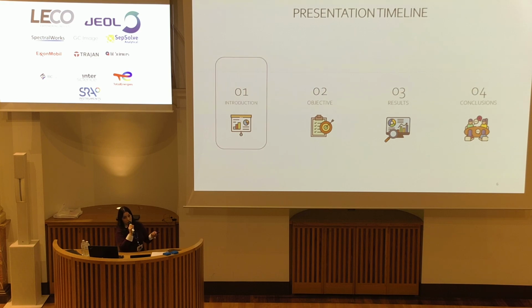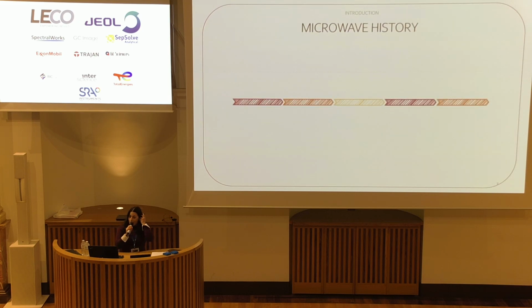As you could see from the title, I will talk about FAMES analysis, and in particular, for this kind of analysis, sample preparation is also important, and in particular, I'm working with microwaves. So I will talk about a bit of this technology that was discovered in 1945, quickly patented, and then in 1947, the first microwave for domestic purposes was sold.